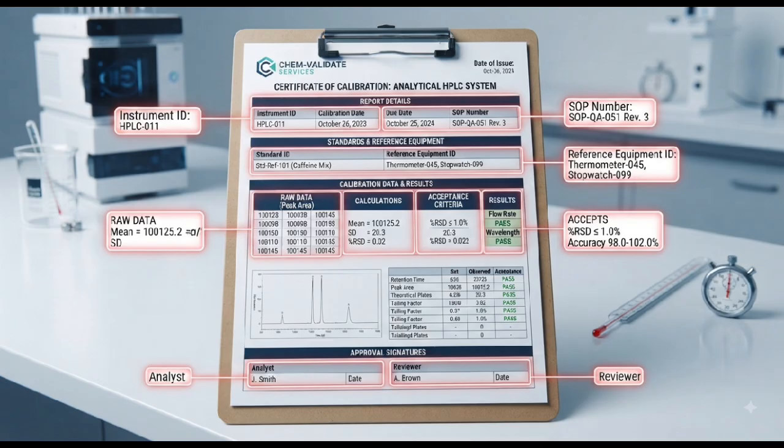Calibration documentation. Complete documentation is essential. A calibration record should normally contain information such as instrument identification number, calibration date, applicable SOP, reference standard identification, reference equipment identification, raw observations, calculation, acceptance criteria, final results, and required approvals. The exact documentation requirements depend on the laboratory quality system.